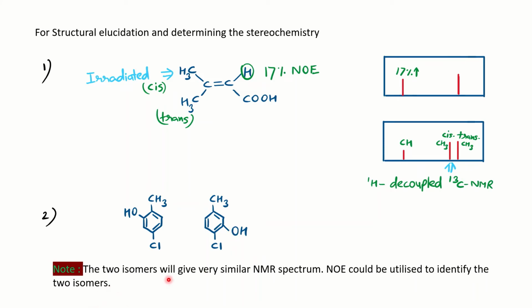So we have discussed NOE. If you get a question related to NOE, you can take either of the examples from here, mention the points, and you can explain it by drawing the plot also.